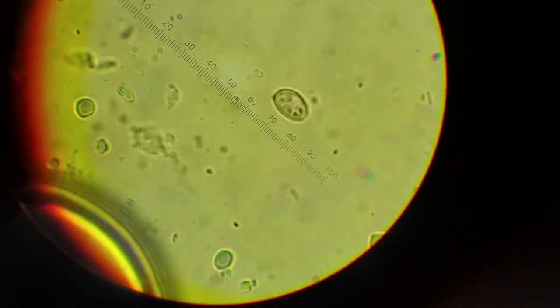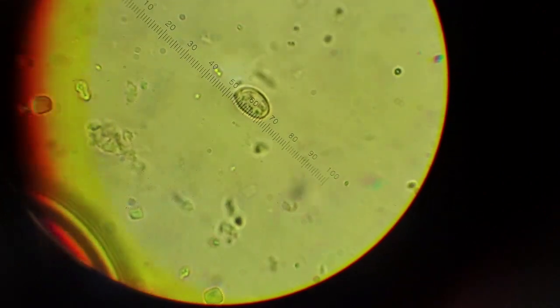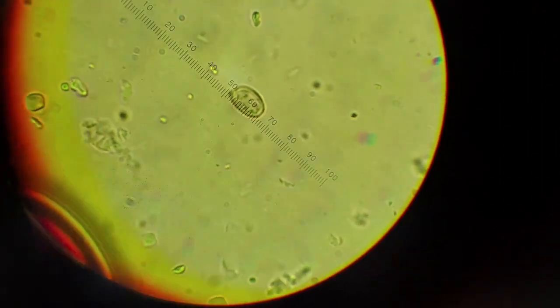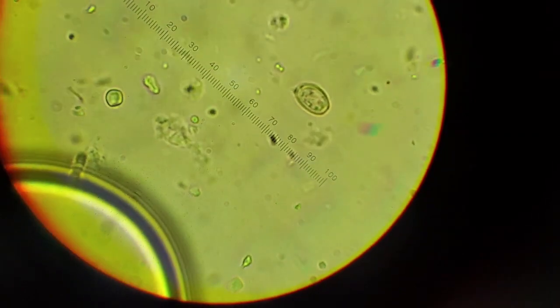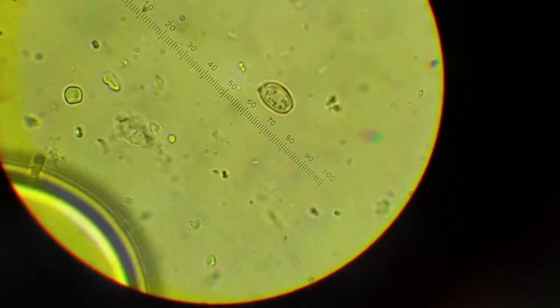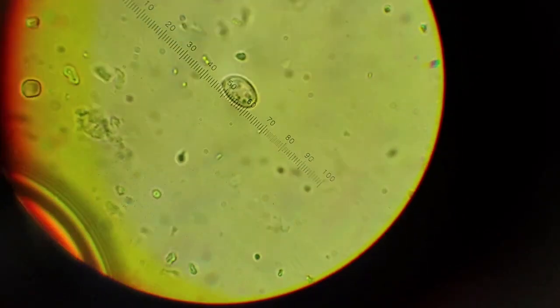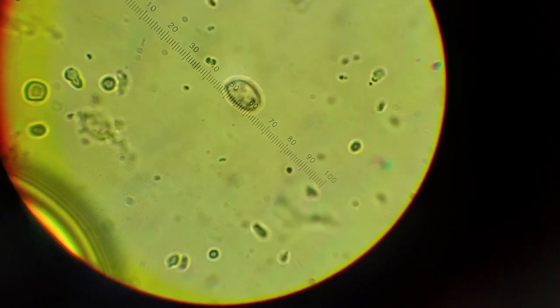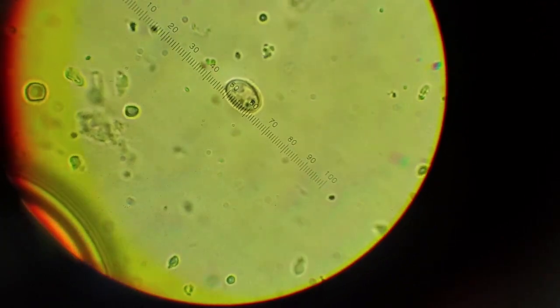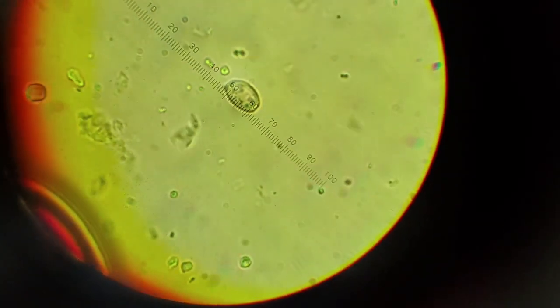This is just incredibly hard to do because, like I said, the phone is just floating just above the eyepiece so that I can record. So this seems much harder than it needs to be, but it shouldn't be that difficult. I can't really do this right now. So what I would do is align the base to the line that says 50, and then measure and see how many microns I can get.